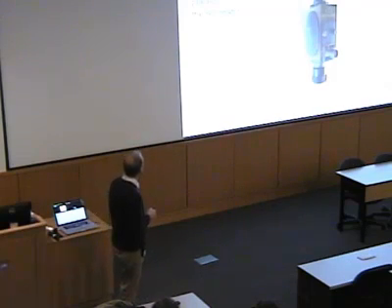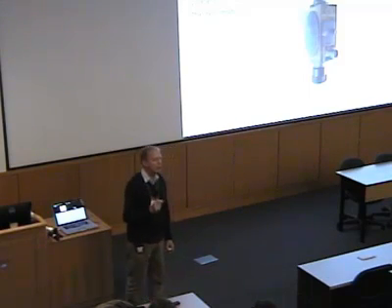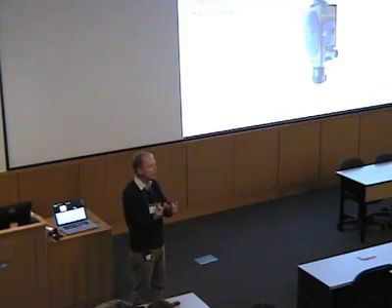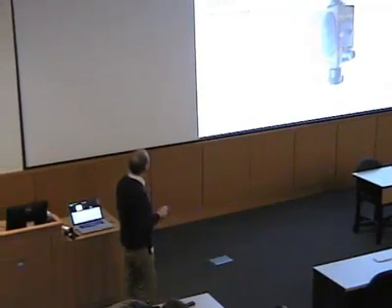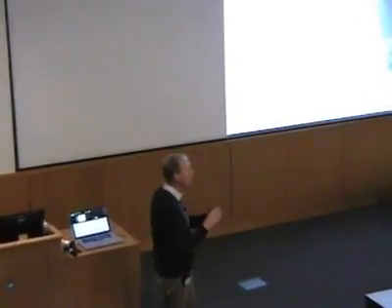And the idea here is that we take our signal and we make it vary in a way that we know. Right? So we sort of encode our signal with a pattern that we can recognize. And then when we measure the signal, we throw away any components that aren't behaving in the right way.